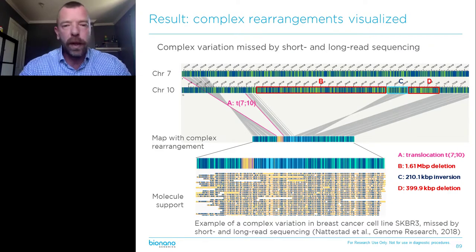So this very complex assembly here, but we have single molecules that span the entire array of this fragment that I just described on single molecules. So again, you cannot be wrong with this type of data.